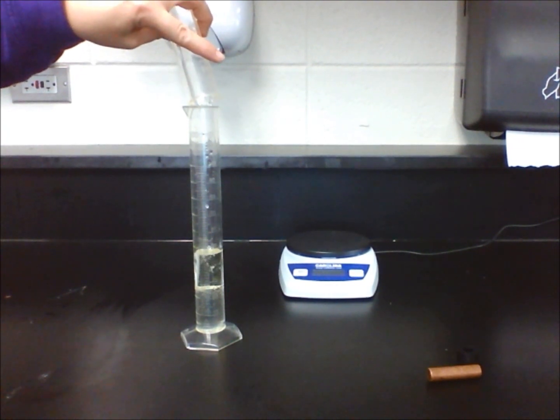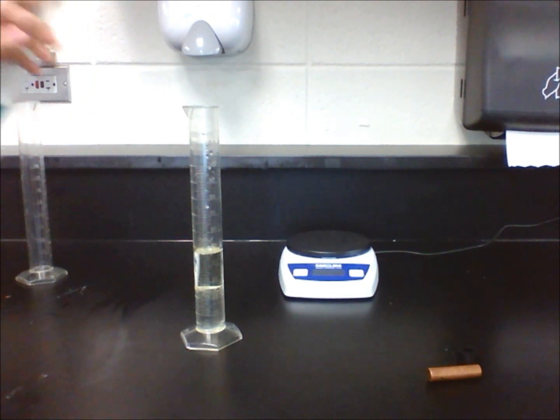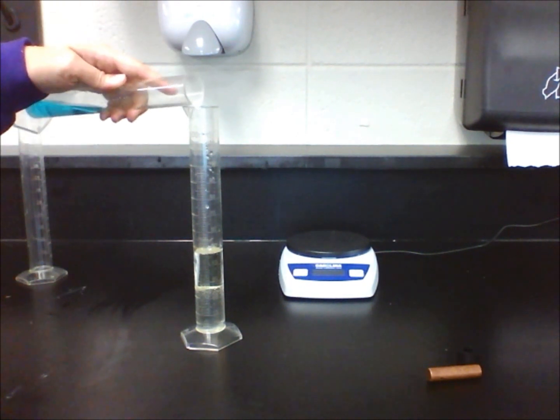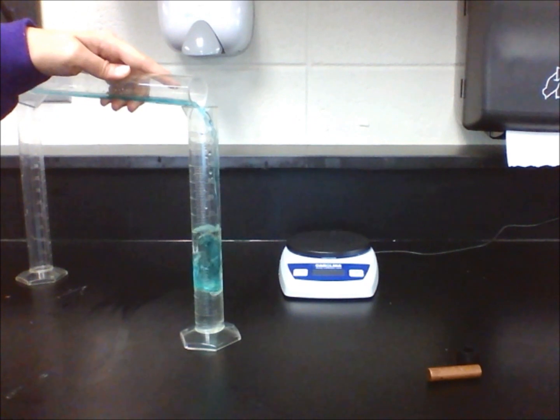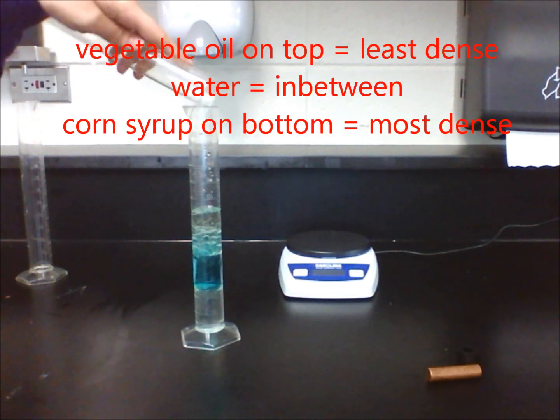Pour the three liquids together and observe what happens. A density column is formed, with the least dense liquid at the top and the most dense liquid at the bottom.